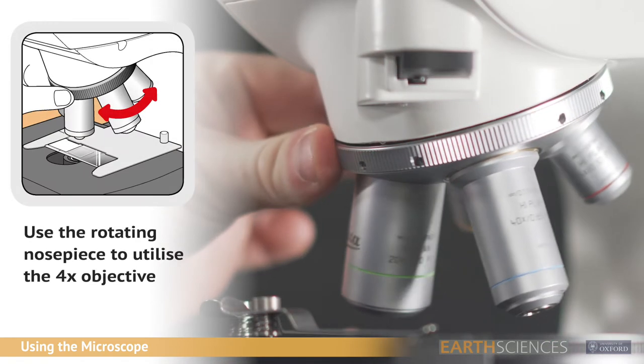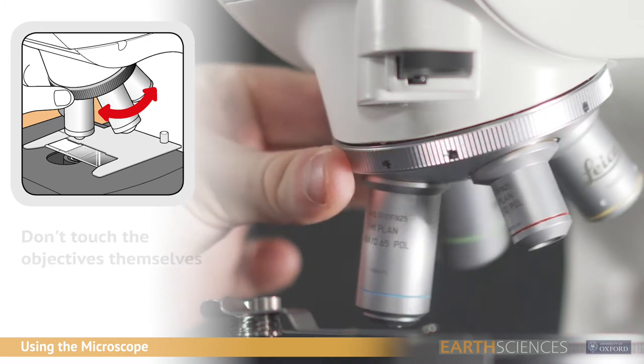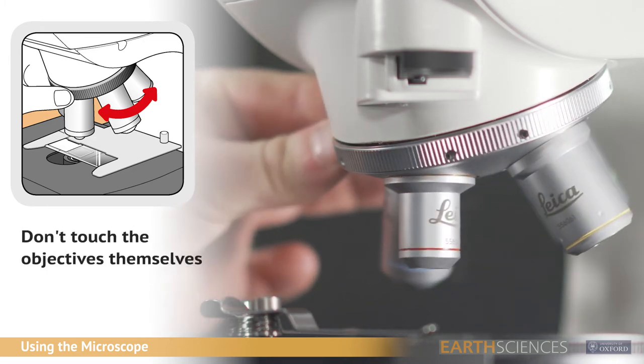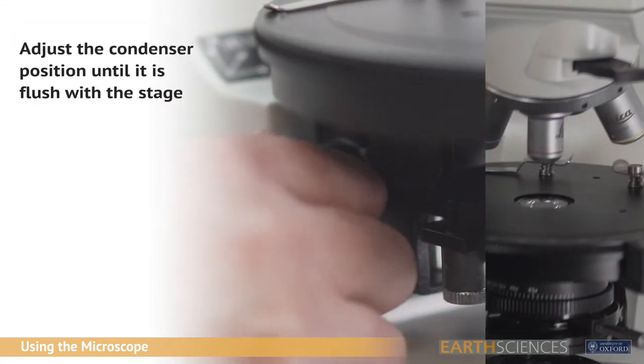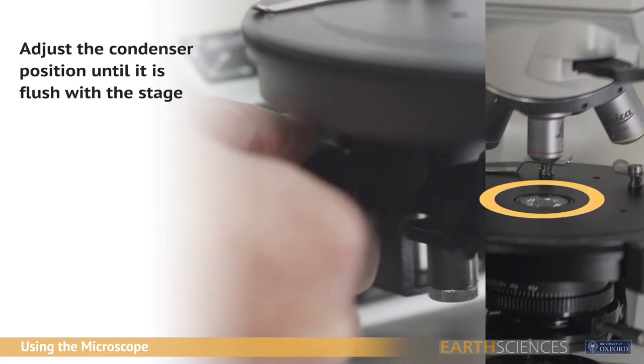Use the rotating nose piece to adjust the microscope to the 4x position. Don't handle the objectives themselves as this could damage the microscope. Use the condenser height focus knob to adjust the condenser until it's flush with the stage.